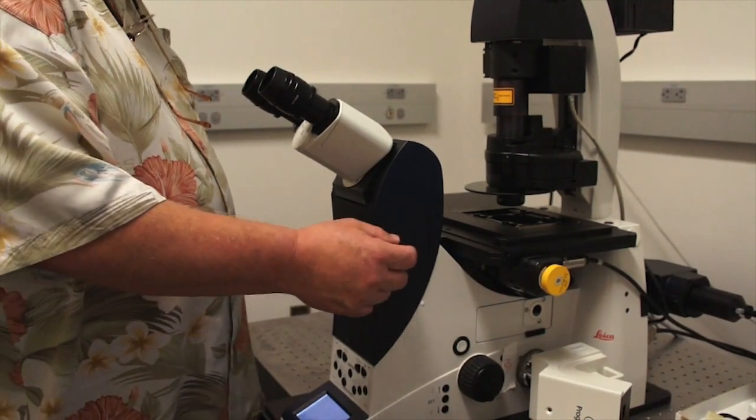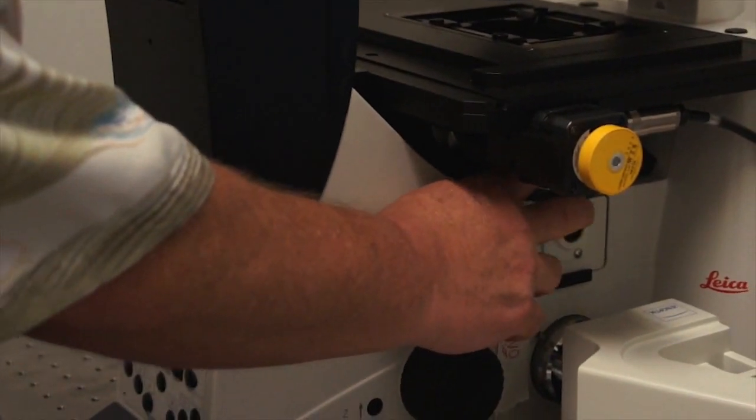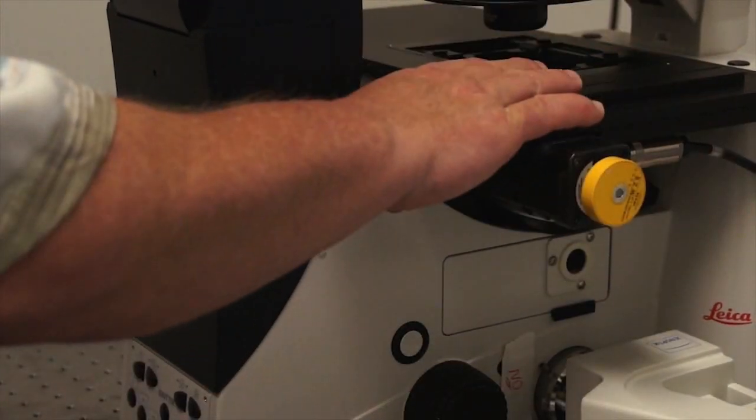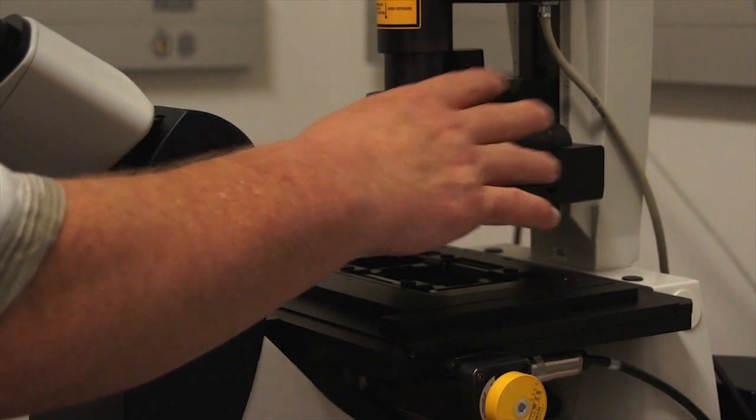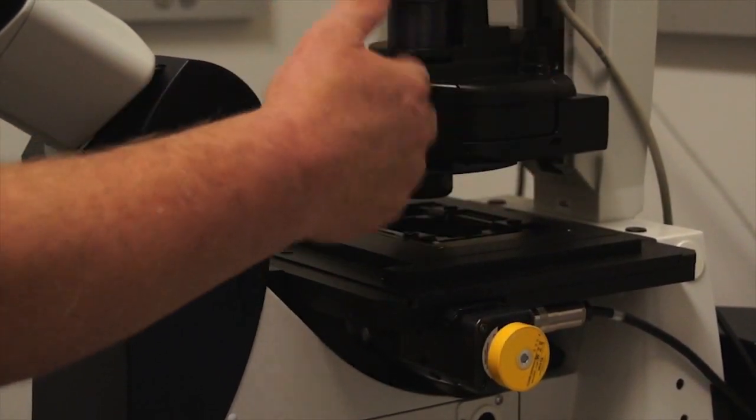For example, the optics are below the stage, so all the objectives that you use for imaging are below the mechanical stage. The condenser is above the stage, before the condenser was below the stage and the optics were above. These are reversed now.